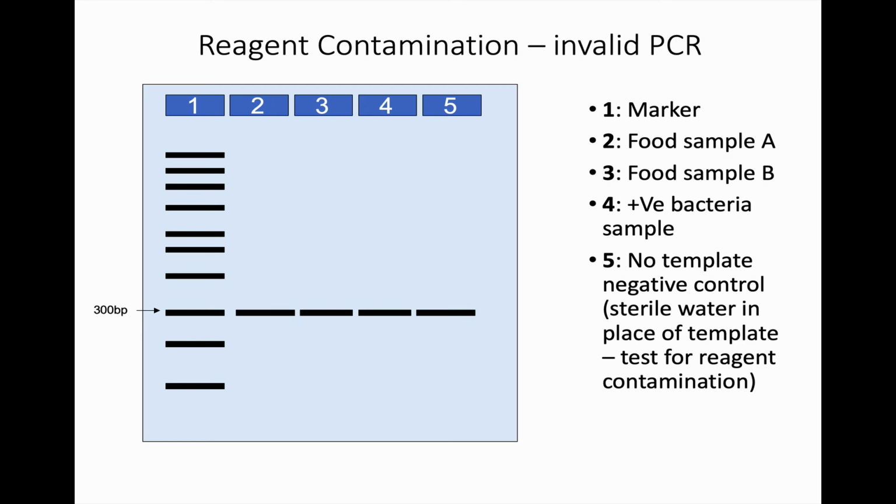So let's just recap what we've talked about so far. PCR is an incredible technique developed in the 80s by a scientist called Kary Mullis. It involves a thermostable DNA polymerase that's able to amplify target regions by going through particular cycles of 3 stages: denature, anneal, extend. And we go through those cycles about 30 to 35 times in normal PCR, or 40 to 50 in other applications that we'll talk about soon.